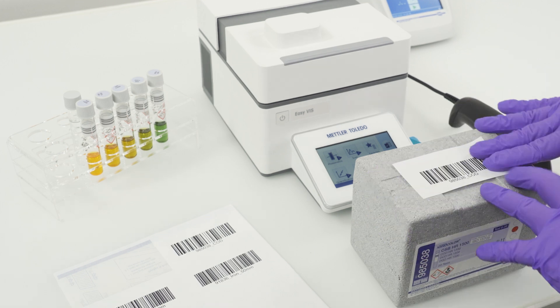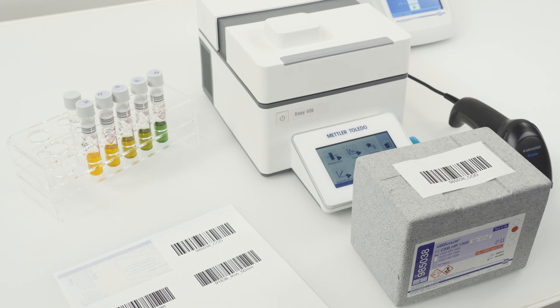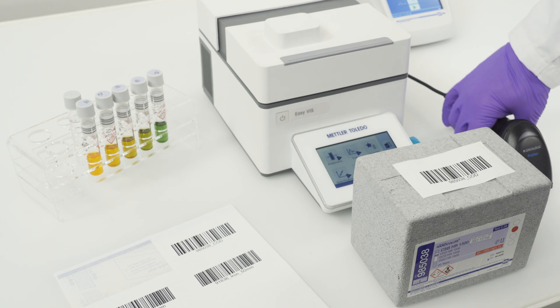Each Nanocolor test kit includes a description of the sample preparation process in the lid of the box. By following the instructions you can be confident that you will obtain accurate results. I have prepared the sample and the digestion step in the thermoreactor is already complete.